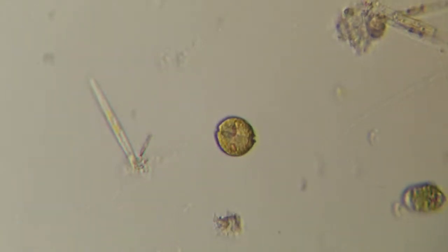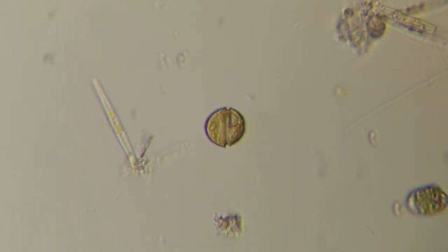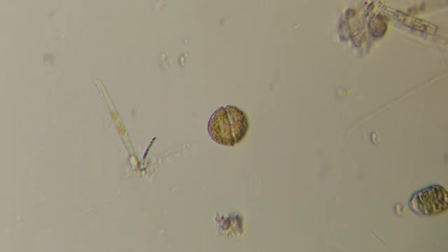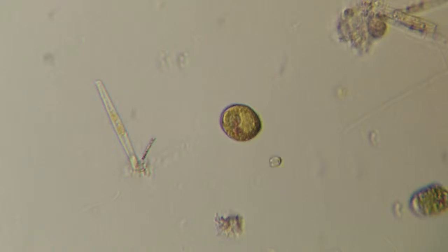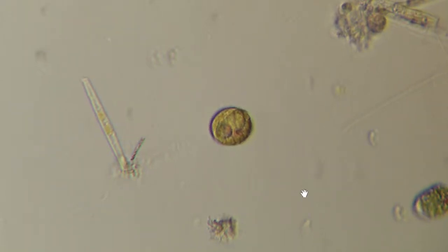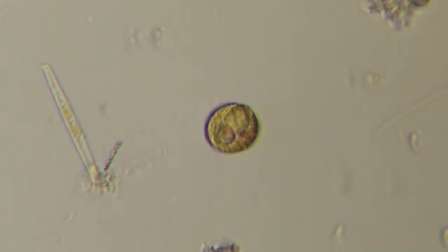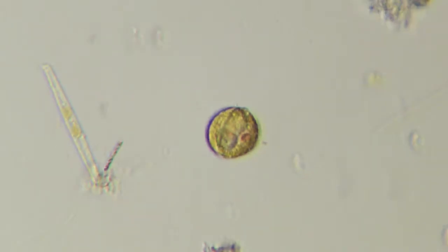I found one of these in the San Francisco Bay before, but now I found another one at the Baylands. Look at that. Looks almost like a coffee bean at this angle. See it rotate? These are the guys that cause red tide. So, if you're concerned about eating shellfish or bivalves, this is a little bugger you're worried about, because they make these nasty toxins that build up in the animals that you eat.